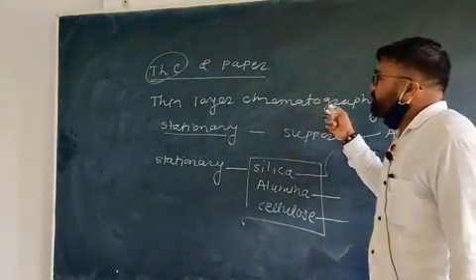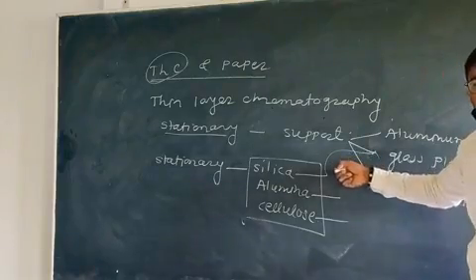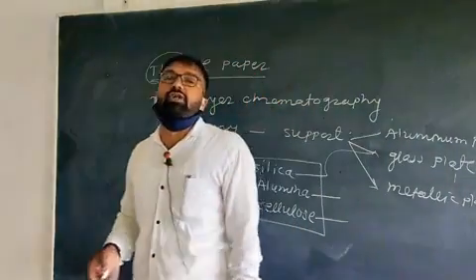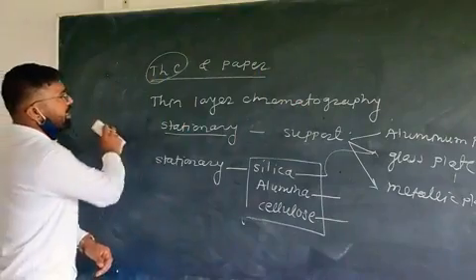In TLC, the stationary phase is a solid and the mobile phase is a liquid in nature. Therefore, separation is done on the basis of the adsorption-desorption phenomenon, right? It was discussed previously, right?